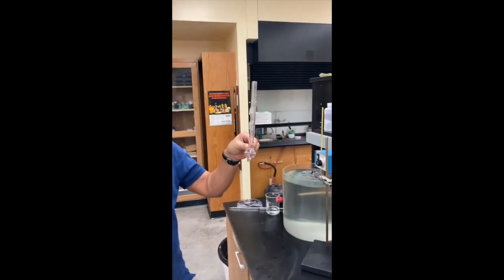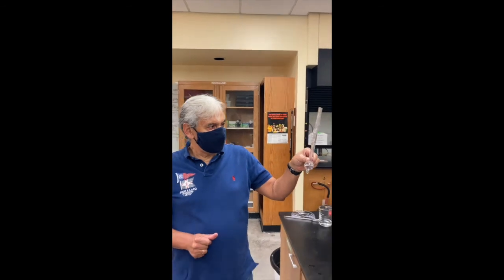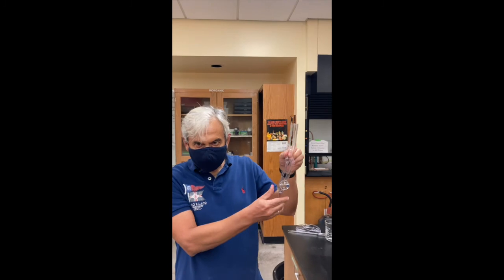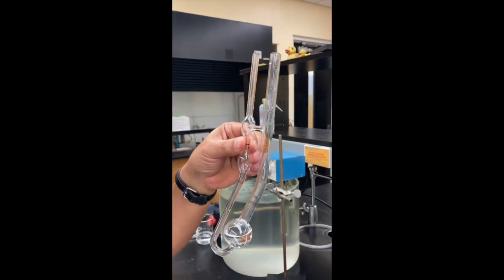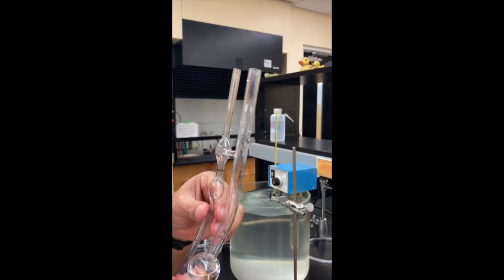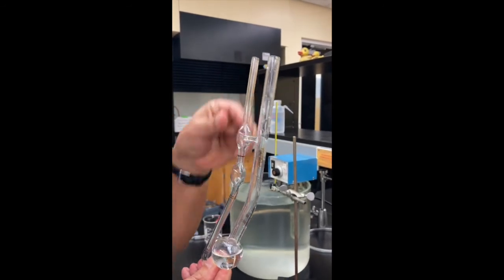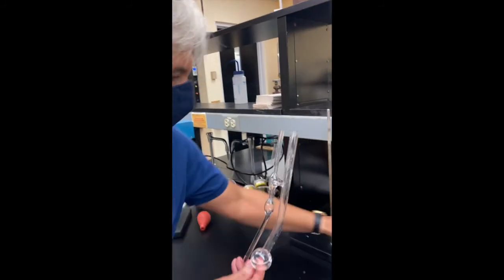Before we do any measurements of time, and between measurements of different solutions, it's important to carefully wash the viscosimeter, rinse it with acetone to remove any small particles which remain in this tube, and also dry it with air, using the air line in the lab.